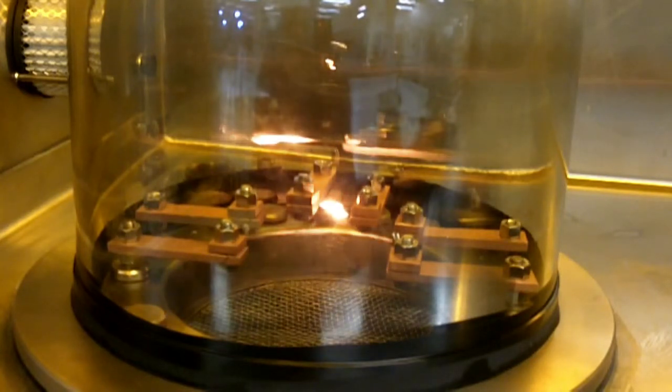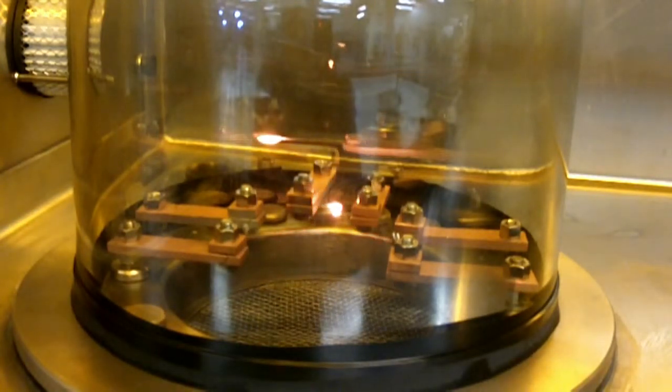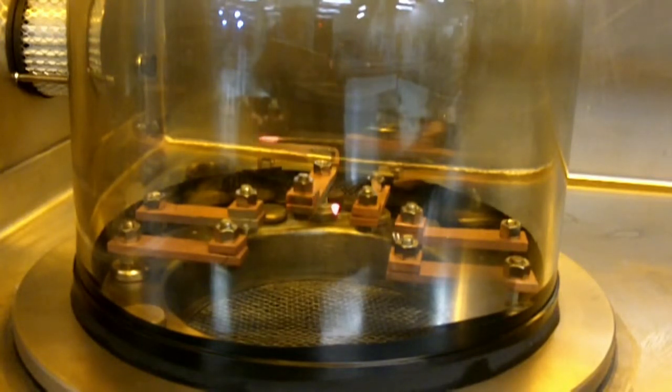When you're done, you can turn down the current. You can see that the filament is still glowing — there's a residual heat on there. Turn the filament power off and move on to your next evaporation.